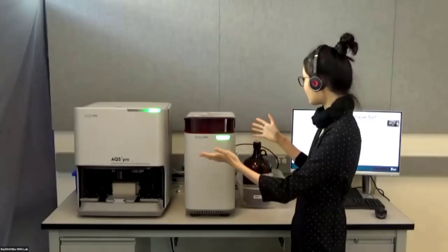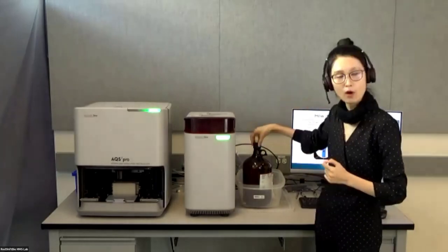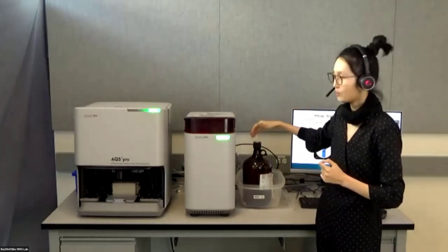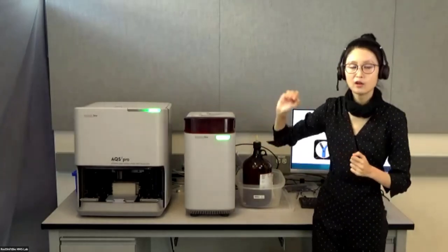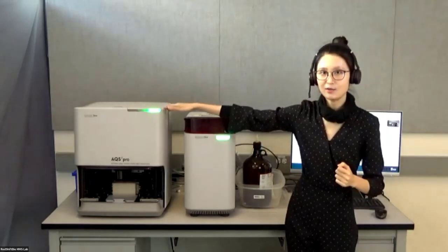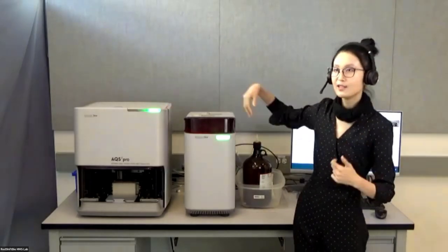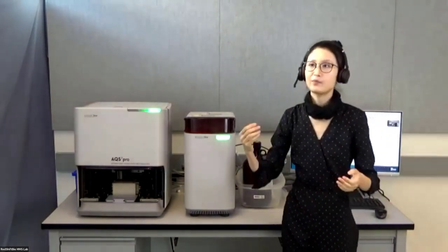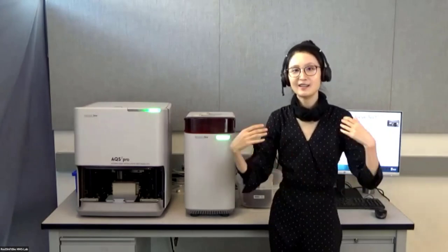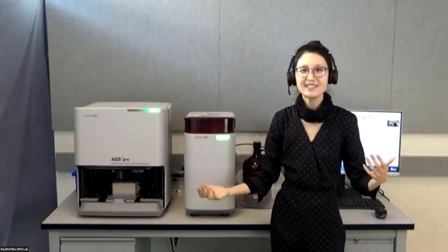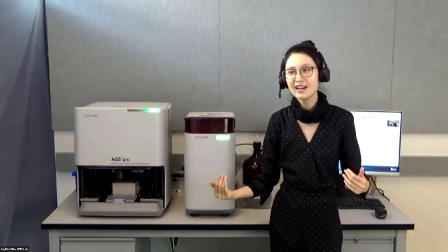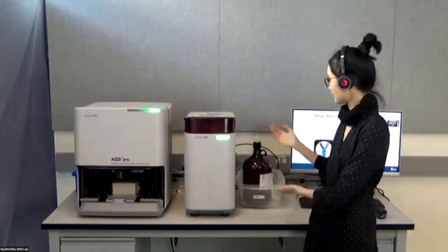The system also includes a system water bottle, which is connected to a water station inside the analyzing unit. This can be used for washing, cleansing, flushing, maintenance, and also health checks. Because we have such a large bottle, you can do it remotely at home.